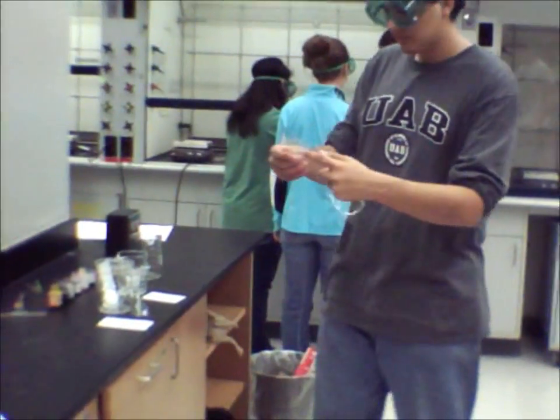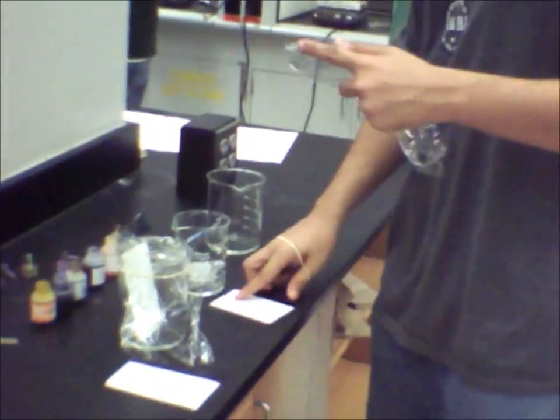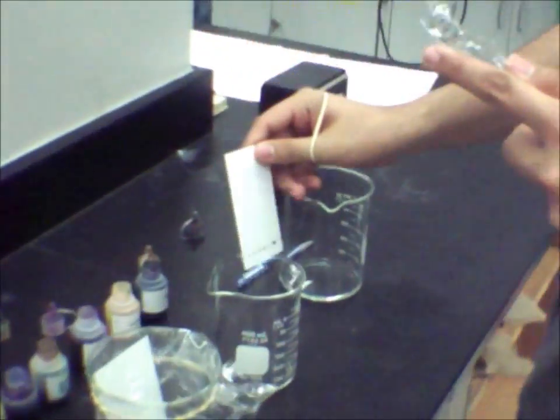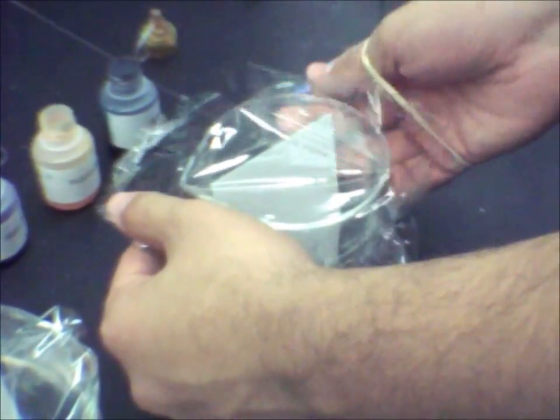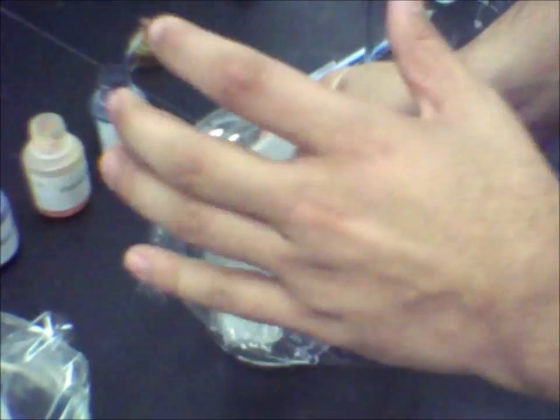Once you have finished, place the plate in a beaker containing solution. Make sure the beaker is large enough so the plate doesn't bend or curve. Then cover the beaker with shrink wrap.